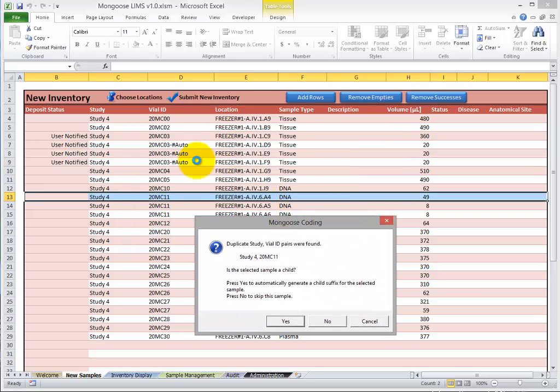So on these last three, you see the child suffix, hyphen, pound sign, auto. That means Mongoose LIMS will automatically generate the child ID for these samples.